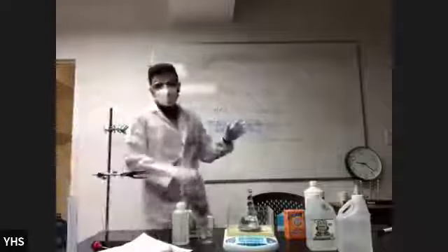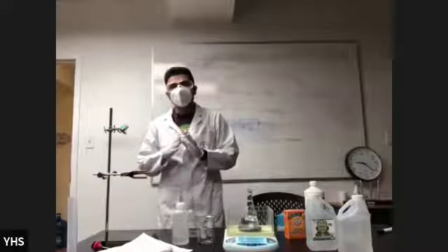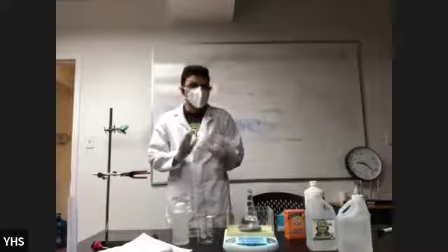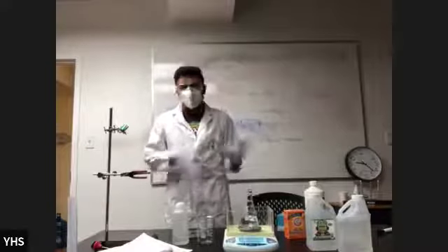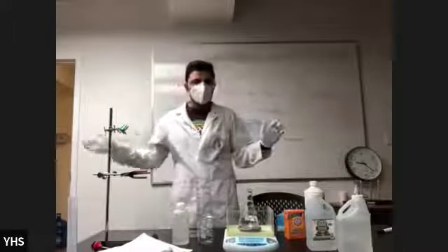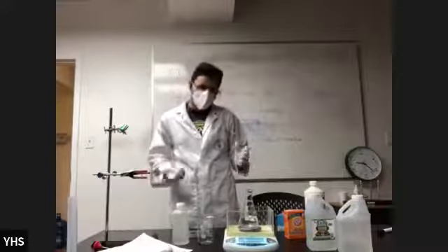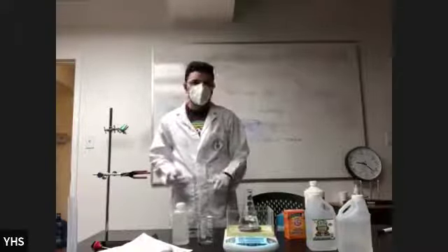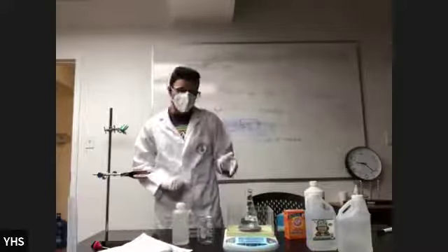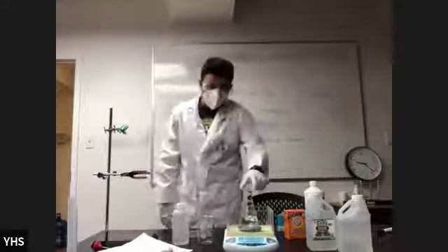So you guys know the connection between milliliters and grams? If I'm saying 150 milliliters, basically that also means 150 grams, but I'm wrong here for some reason, right? While doing the lab, nothing is always the same, okay? There is going to be some changes, and we need to think about that as well. So right now, my measurement, according to my scale, is around 5 grams off, but that's fine, okay? We'll still have to go with what we have here, 145 grams. Good? Okay, this is done.